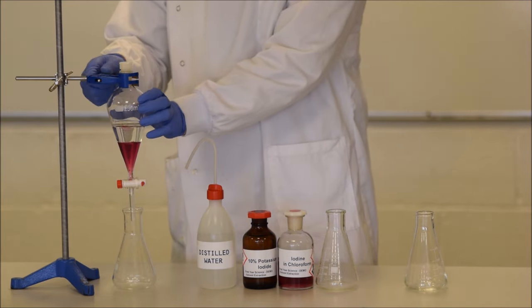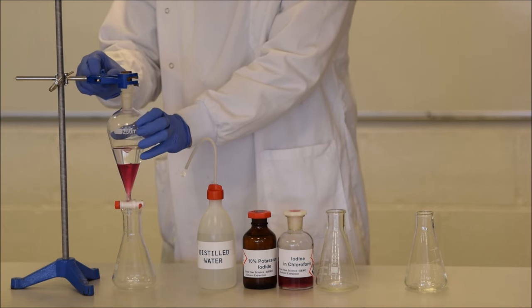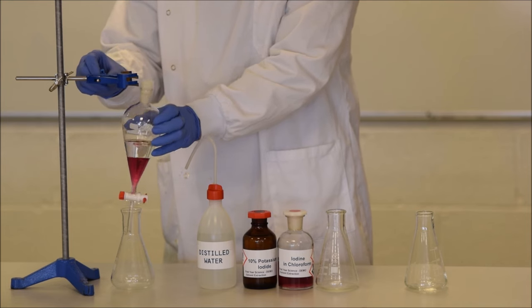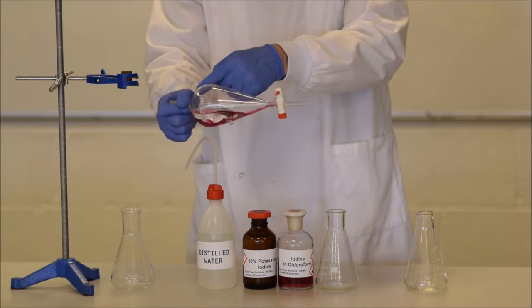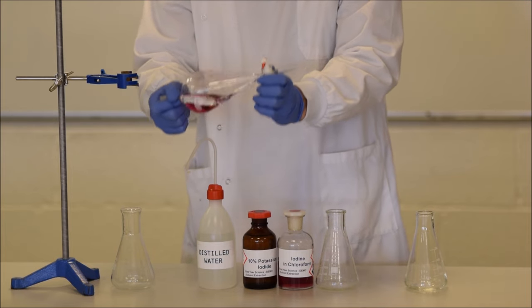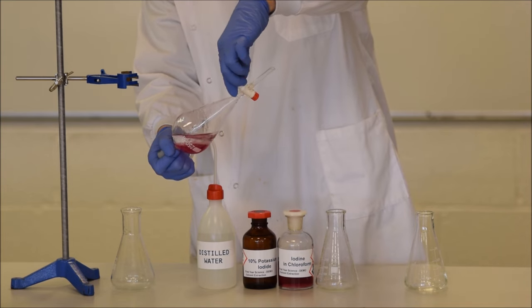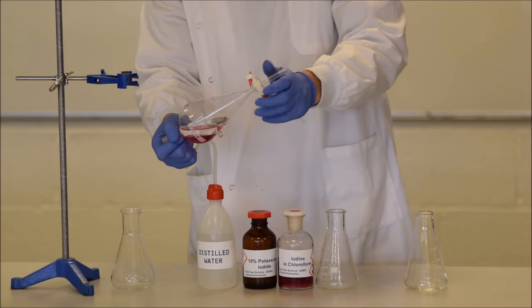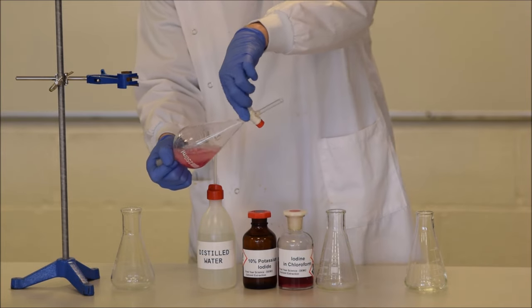Next, I put my lid in and I take my separating funnel out of the clamp. And now what I'm going to do is shake it. Before I shake it, I have to make sure of two things. One, that the stopper is securely in place, and two, that I'm holding it so that it's not going to fall out. Give it a small shake and then vent the pressure out, so it will immediately have some pressure form inside. Vent it, give it a much stronger shake, and then vent it again.